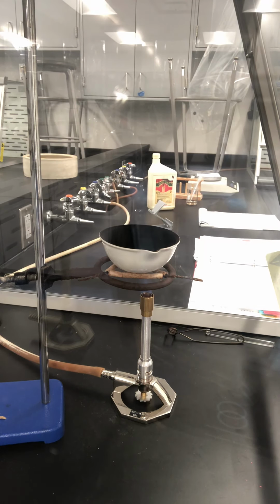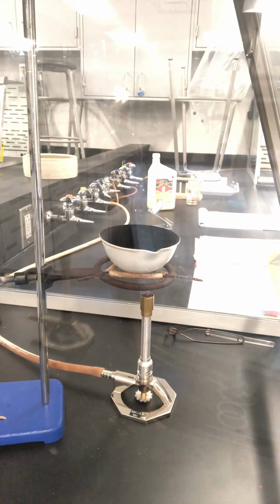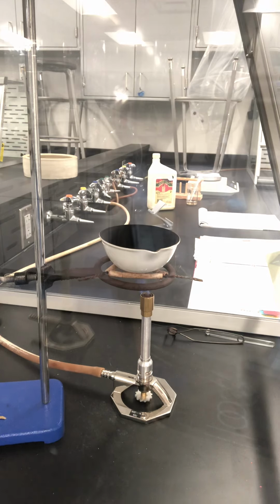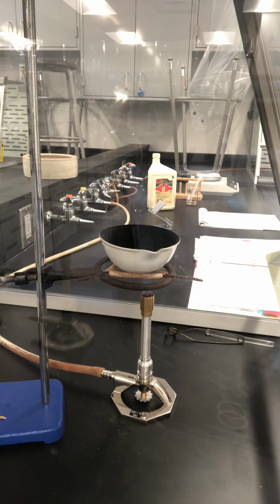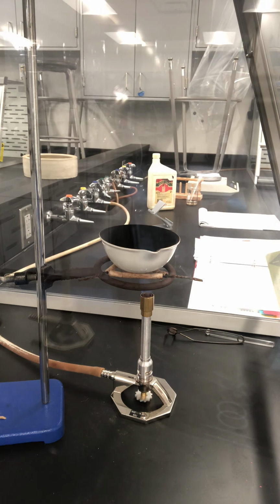And continue with that while we add sulfuric acid. So sulfur turns to sulfur trioxide. Sulfur trioxide reacts with moisture to produce sulfuric acid. And sulfuric acid can also react with metal additive.